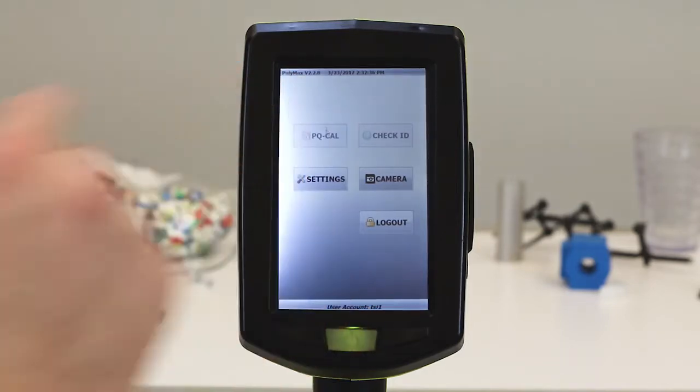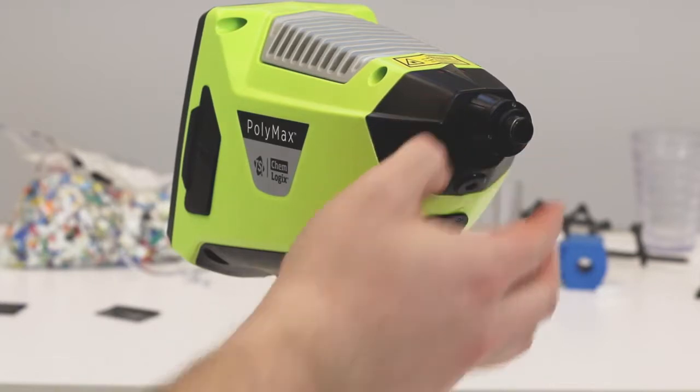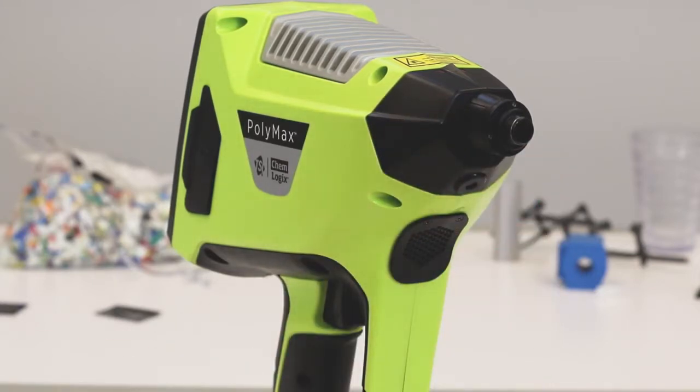Begin by pressing the PQ-Cal button. The PQ-Cal function is used in conjunction with the calibration toggle located on the front of the instrument for calibration verification. Make sure that this toggle is set to calibration material before proceeding. This means that the red dot on the toggle should not be visible during PQ-Cal.